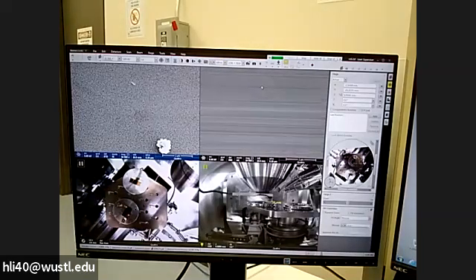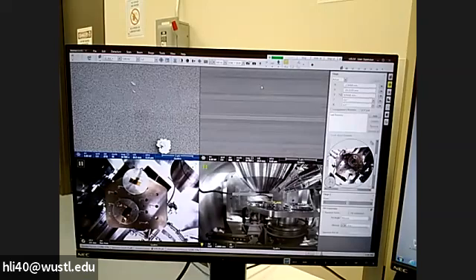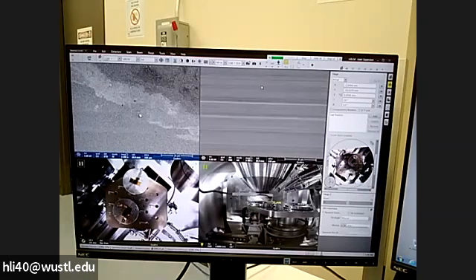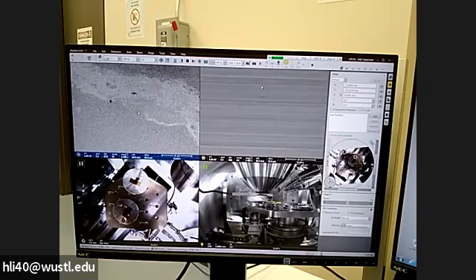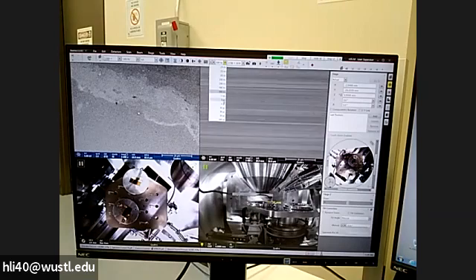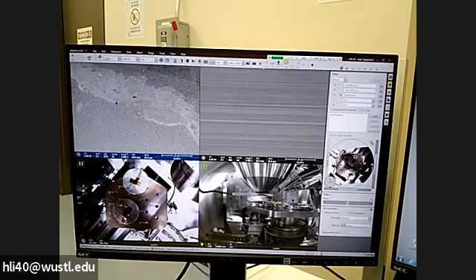Now I want to change the magnification to 10,000 or maybe 500. So I just need to change the magnification, and we can just take an image. I change this back to maybe 5 microseconds. I use one integration, two integrations. If I like it, I just click the pause button. You can also adjust the contrast a little bit to make it what you like.